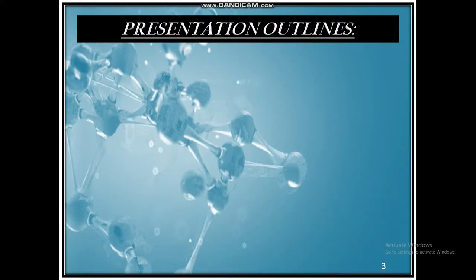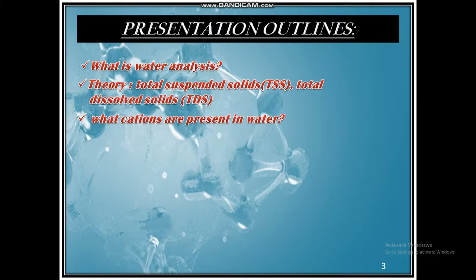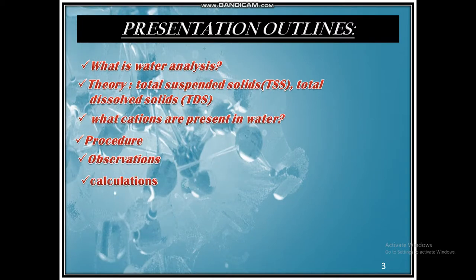Presentation points. What is water analysis? Theory for total suspended solids, total dissolved solids. What cations are present in water? Procedure, observations, and calculations.